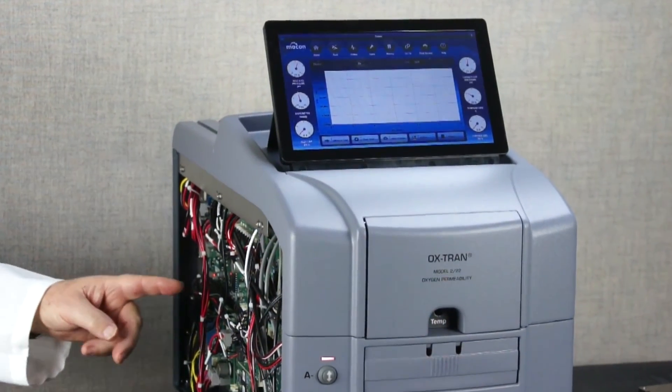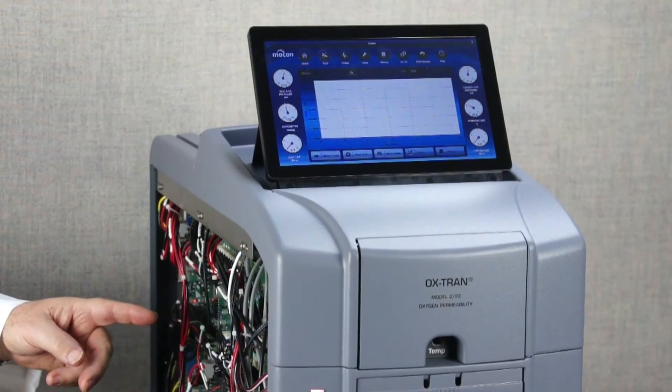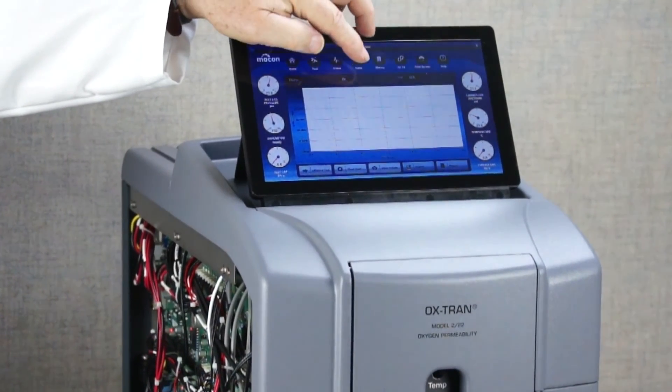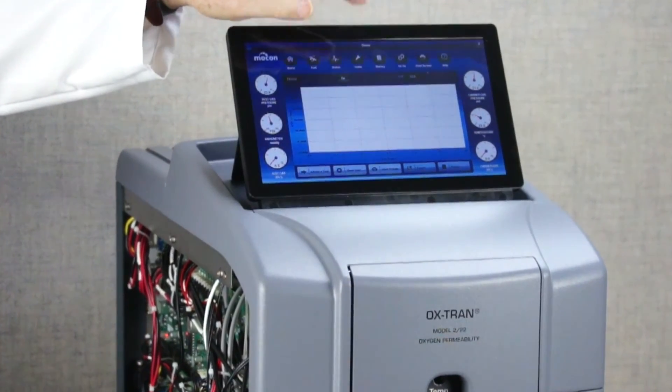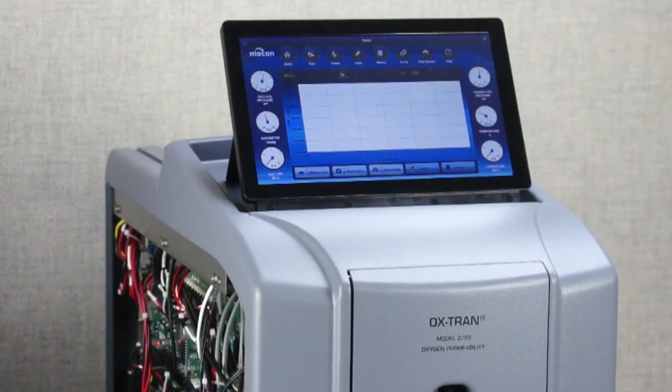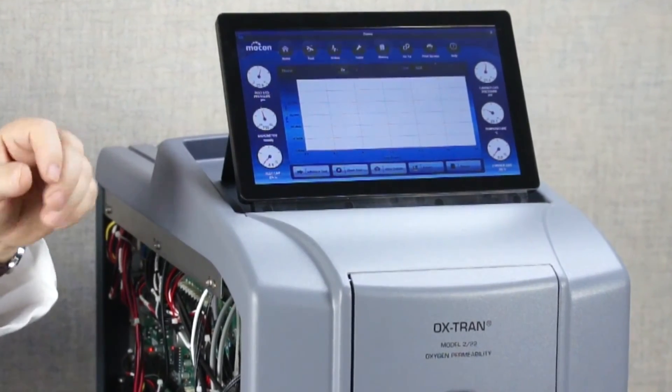Up to 100 tests will automatically be saved to the onboard hard drive. You can access these via the History menu, where you can sort, select, delete, and export.